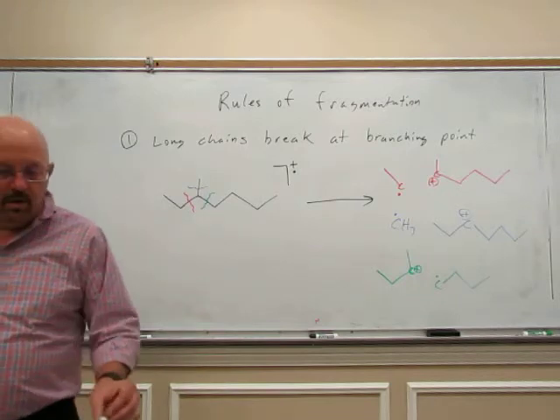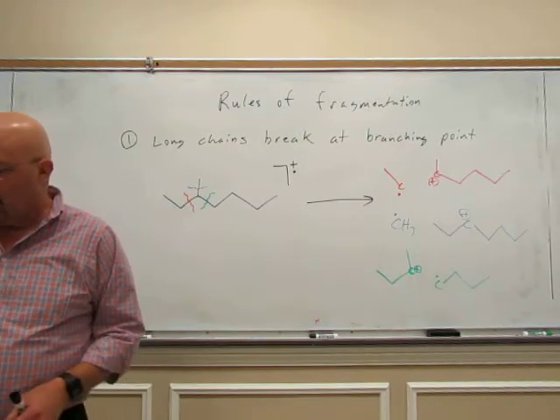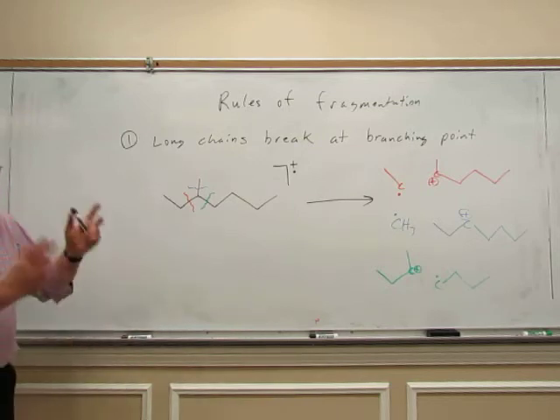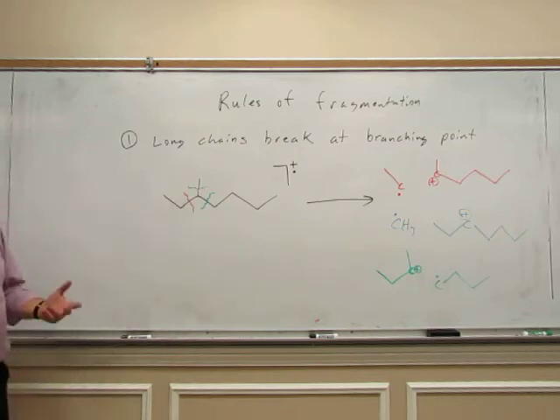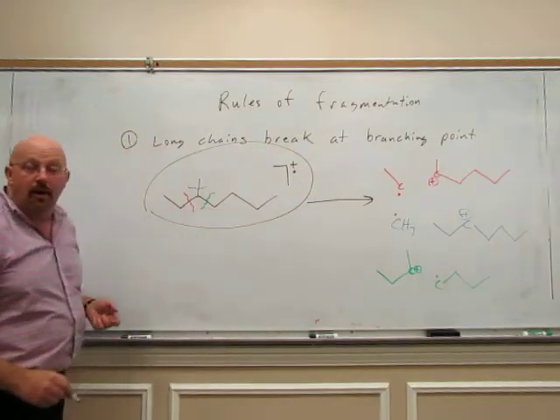Now, which way does it like to go? All of those will happen. All of these will take place. We will see, remember, only the cations show up. You get a peak for the mass of every cation. So this one will show up. That's our molecular ion.